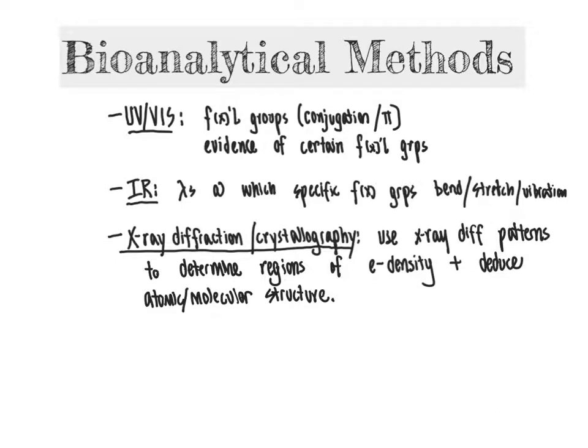But if you are able to crystallize a molecule, meaning a small organic molecule such as penicillin or cholesterol or some other organic molecule, you can oftentimes determine the complete molecular structure of this, including the stereochemistry, including the configuration at all of the stereocenters in the molecule. So that makes it a very powerful technique, but only in cases where the compound will crystallize. So going on down the list in our arsenal of bioanalytical methods, we next come to mass spectrometry, which we abbreviate as MS for short, for mass spectrometry.